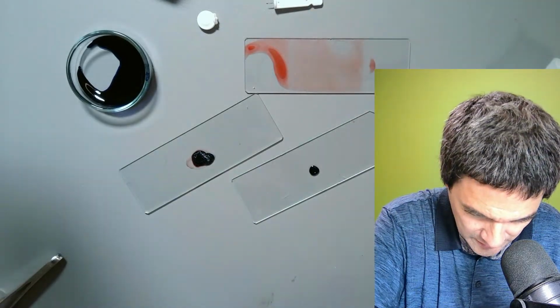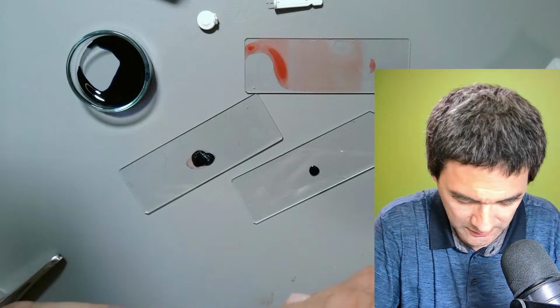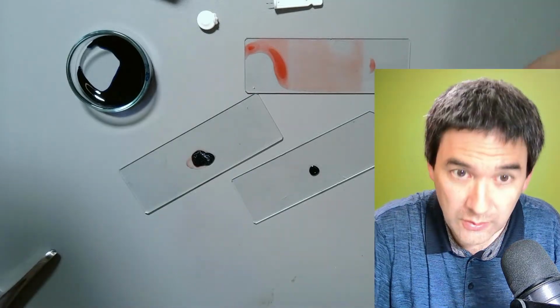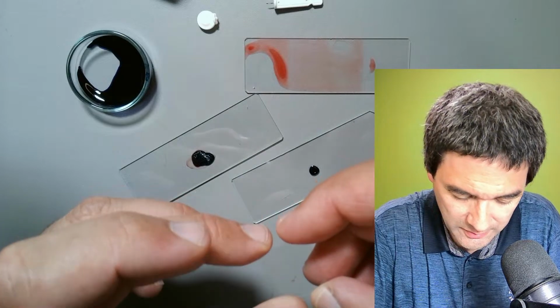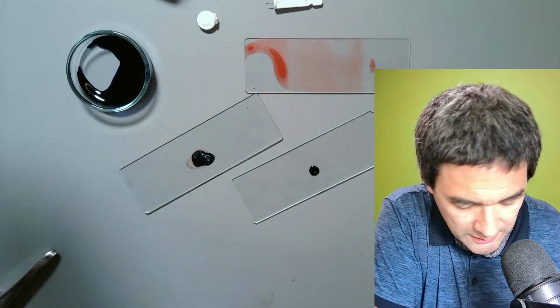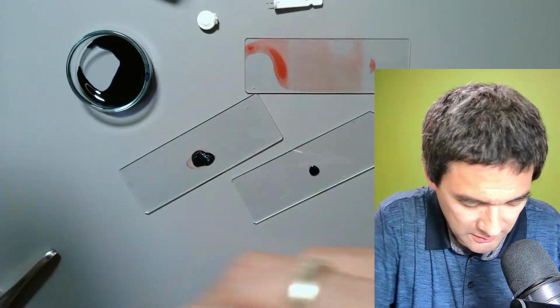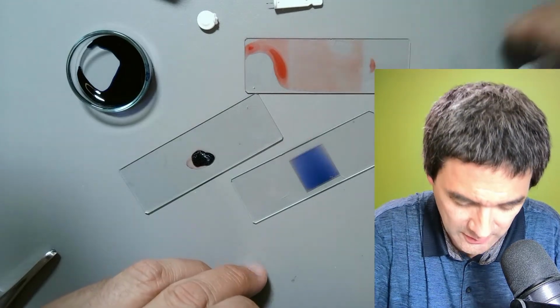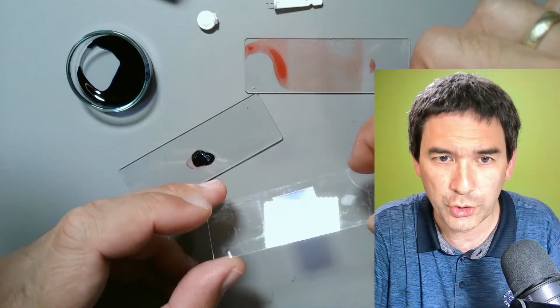Where is my cover glass? Not this one over here. I use these ones over here, still a little bit smaller. And let's try it here. I see it's significantly more bluish.